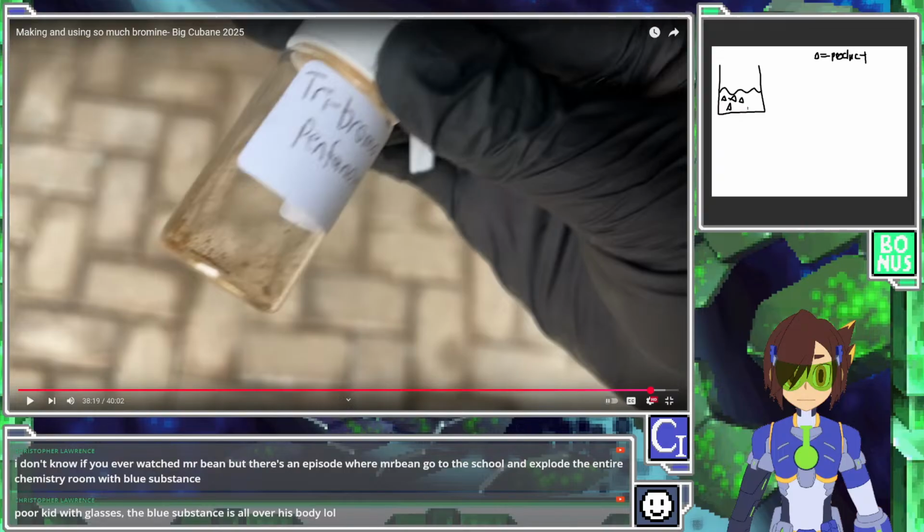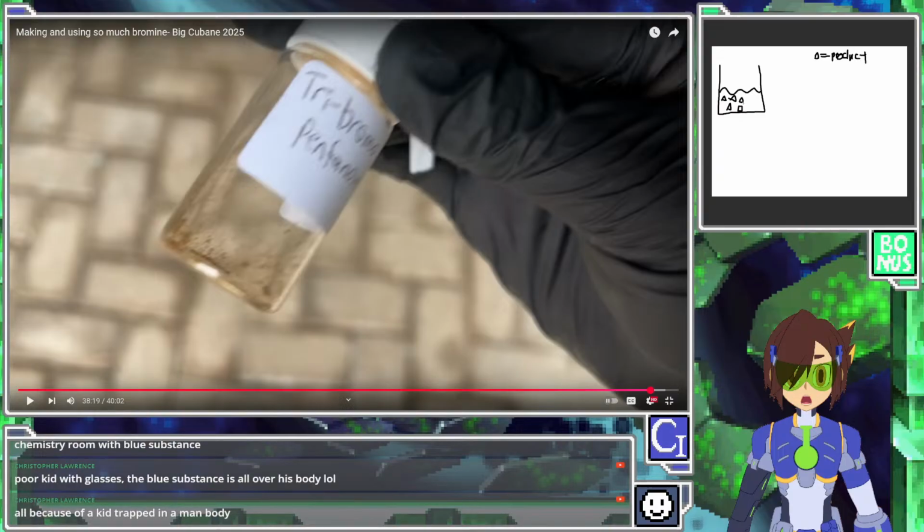Product. And then you have a whole bunch of other squares that are your impurities. So we'll just say squares equals crap. That's a scientific way of putting it. Oops, wait, I changed tool by accident. Okay, there we go.